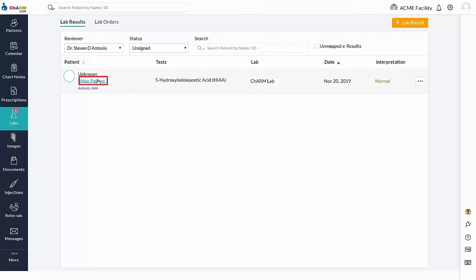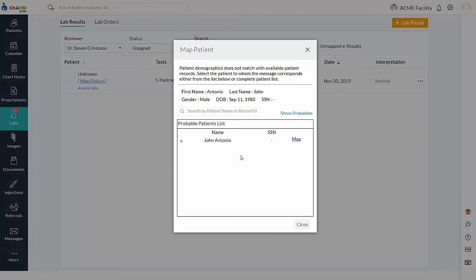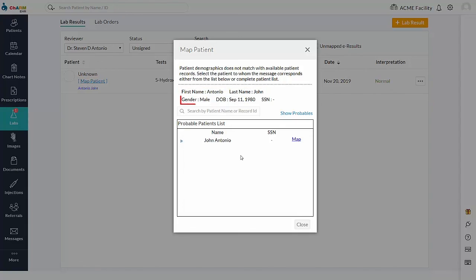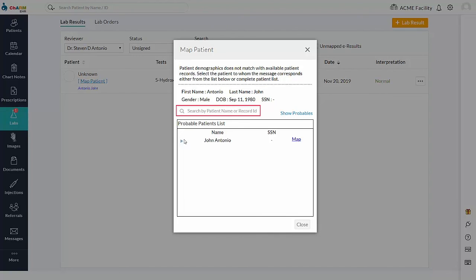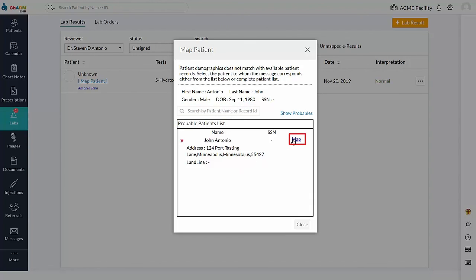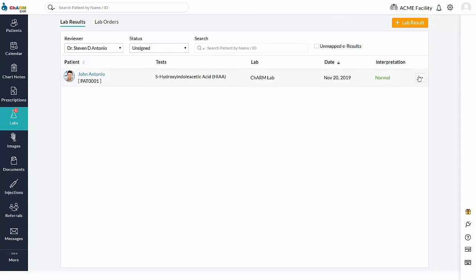Patient can be mapped to this result by using map patient option. Map patient view shows the patient details received in the result message and also the probable patients available in your account based off of date of birth and gender of the patient details received in the result. If the probable patient's list does not have an appropriate patient, use search by patient name or record ID field to pull the matching patient's list by name or record ID criteria. Map the appropriate patient to the result. Result can be reviewed after assigning an appropriate patient.